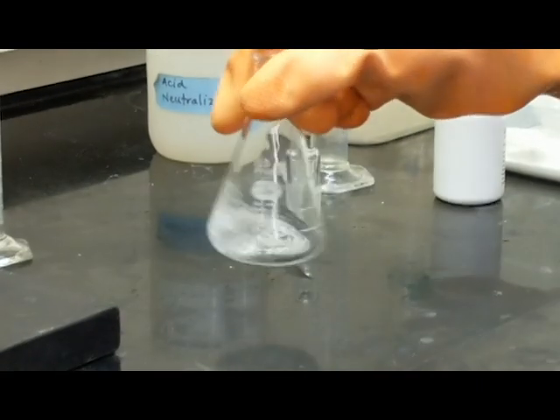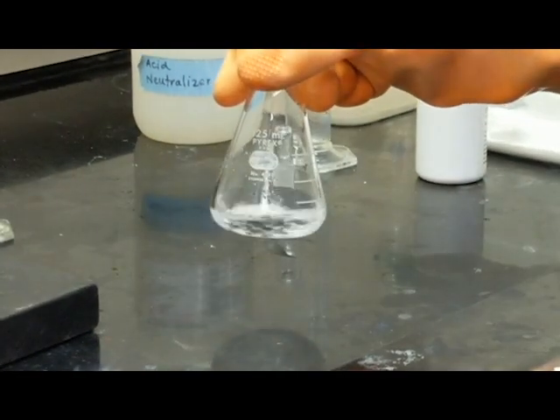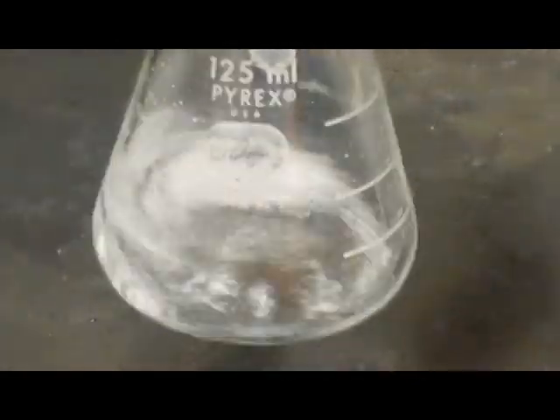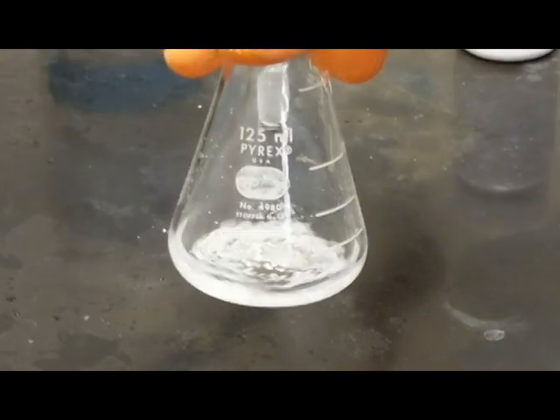To dry your final product, swirl the contents of the organic layer with the calcium chloride. Notice that some of the calcium chloride has started to clump together. That's a sign that there was a slight water contamination. If you see one giant clump of calcium chloride, consult your professor to troubleshoot that. If your calcium chloride dissolves entirely in your final product, you've made a gross error. Calcium chloride is soluble in tap water. It is not soluble in the organic layer.